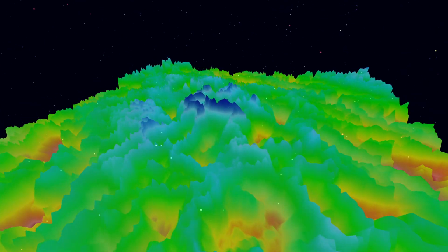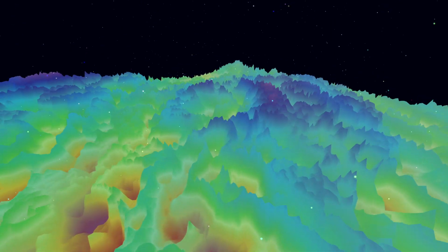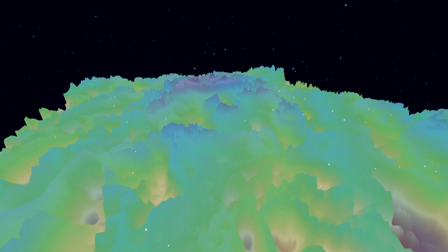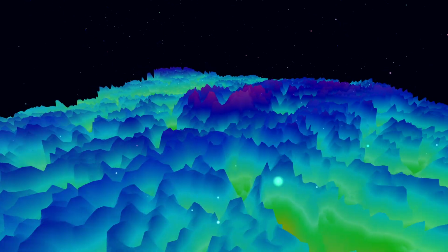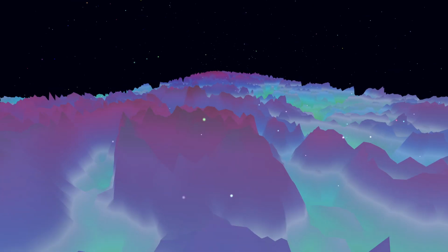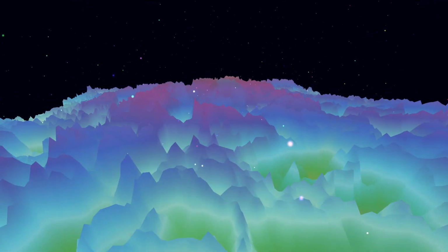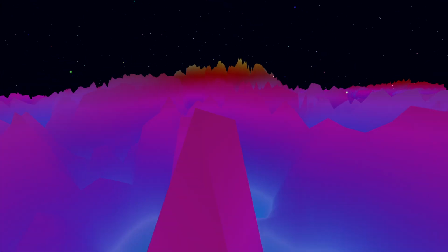Okay. What else can UPS do? It's really good for measuring the work function of the material itself, the minimum energy needed to pluck an electron right off the very surface. And for molecules, especially in the gas phase, UPS can actually resolve the energies of individual molecular orbitals. So you get direct insight into the bonding between atoms in a molecule. You do. It's fundamental information.